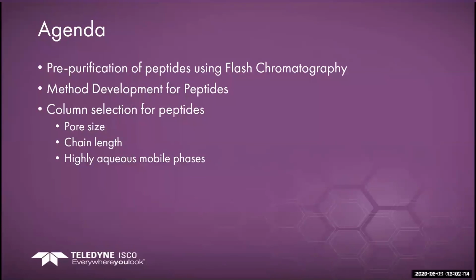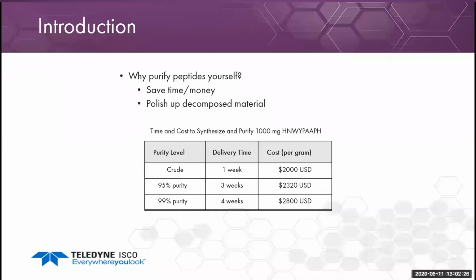We will discuss the effects of pore size and reverse phase alkyl chain length. During the webinar, we will also show how the choice of reverse phase column is affected by the use of highly aqueous mobile phases. Many people purchase peptides from a company that specializes in producing them.